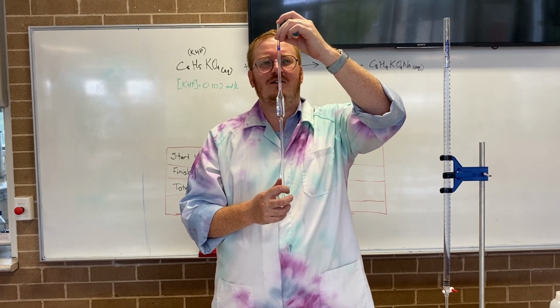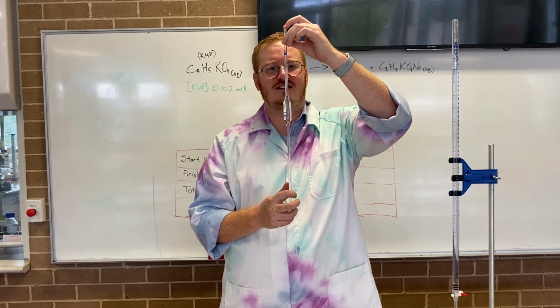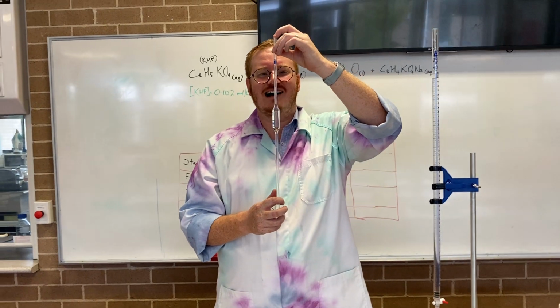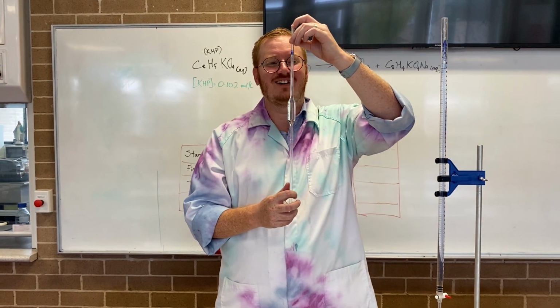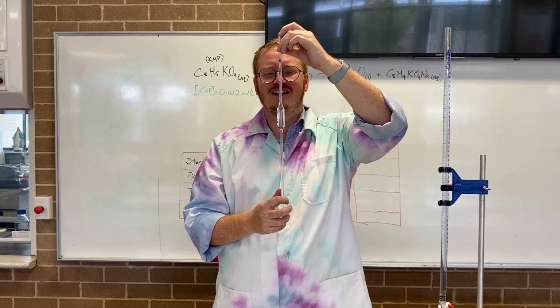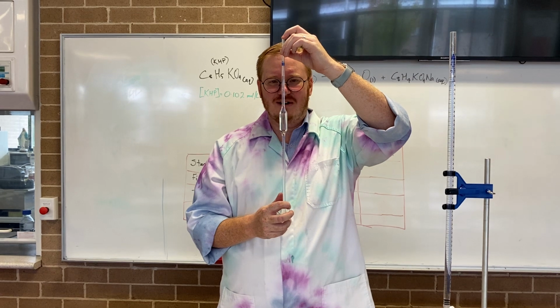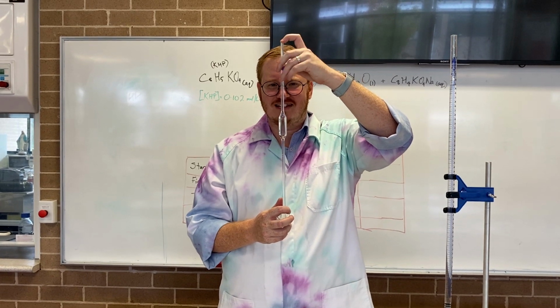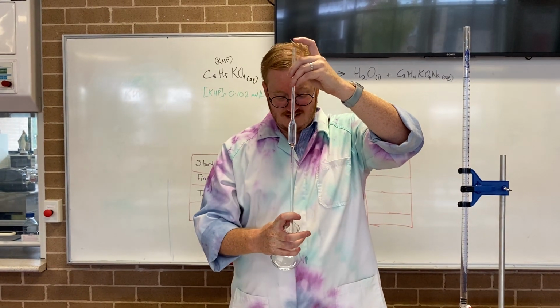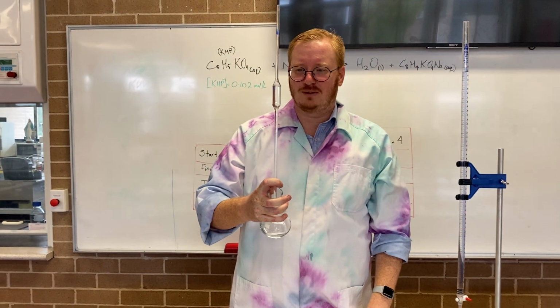And it's quite easy to tell what they've got in each by using phenolphthalein or an indicator, and it quite often turns out that they've got both in the flask and the burette, they've got the same thing, like they're titrating an acid with an acid. That's not going to work. Or they're titrating a base with a base, and they get to a point where they're like, nothing's happening, there must be something wrong. Usually is. They're adding an acid to an acid. One of the most common problems.